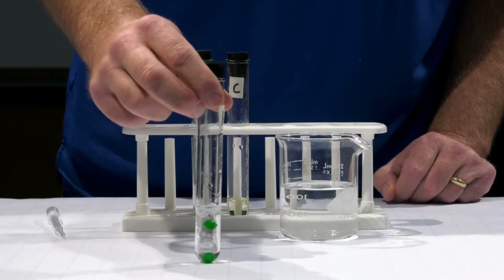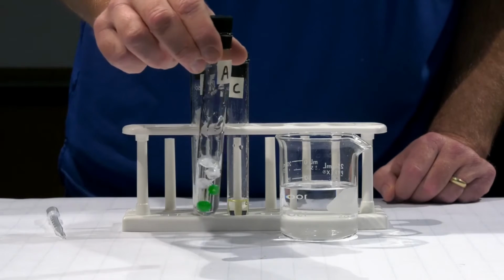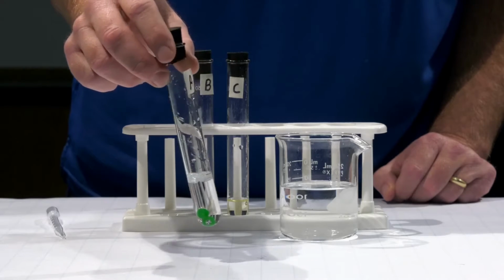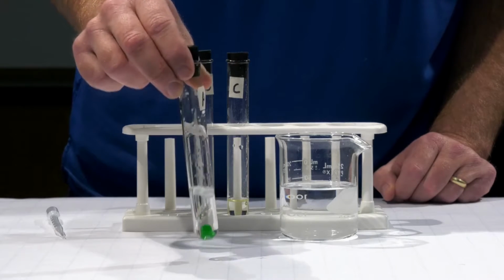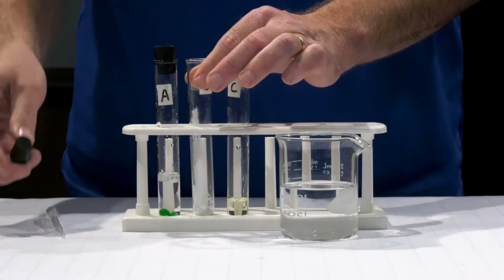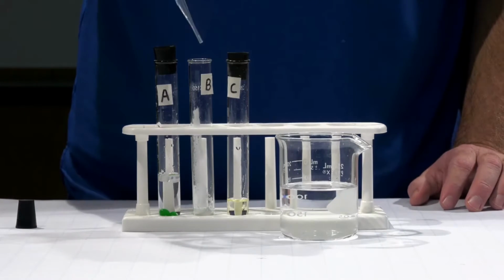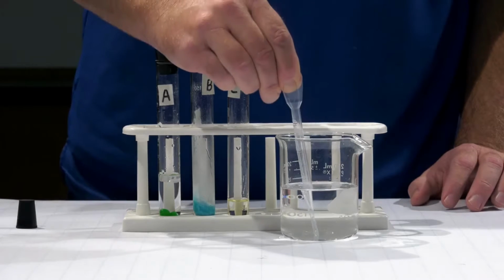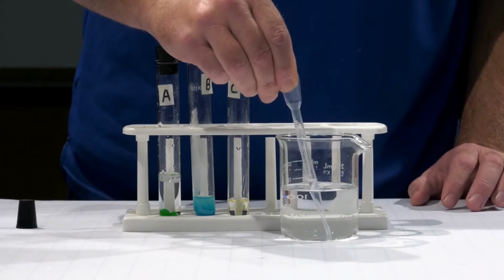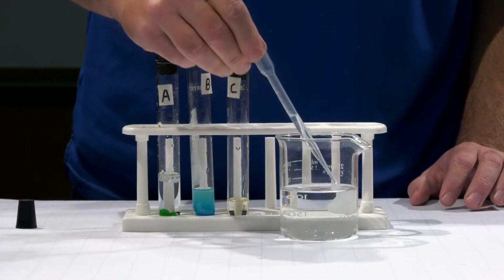So when mystery sample A is shaken, do we observe any changes? Write that down in your observation chart. Next, water is added to test tube B. Ooh, we see a change, don't we? Do we think this change is a physical change or a chemical change?